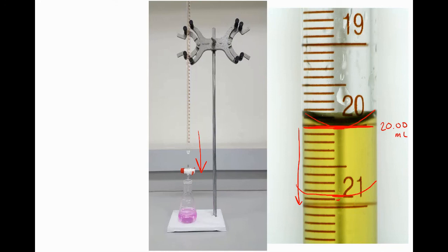So what you have to be careful of is this little mark right here is not 21.1. Instead, you start at 20 here, and this becomes 20.1, 20.2, 20.3, 20.4, 20.5. And so everything between this line is greater than 20, but less than 21. Then starting at the 21 line, that's where it would go 21.1, 21.2, and so on and so forth. So just be careful as you're reading that you're making sure to make the correct measurement. So for example, this would be 20.5 instead of 21.5.